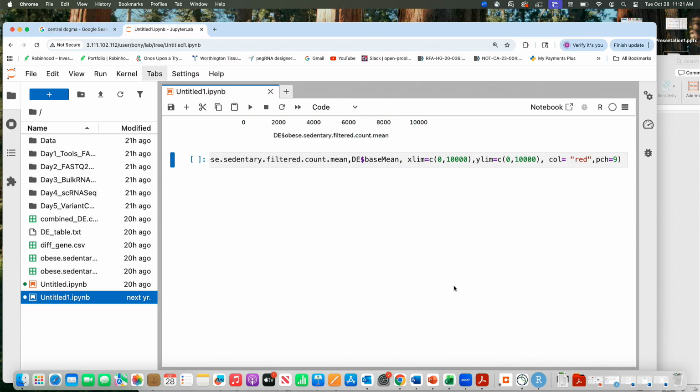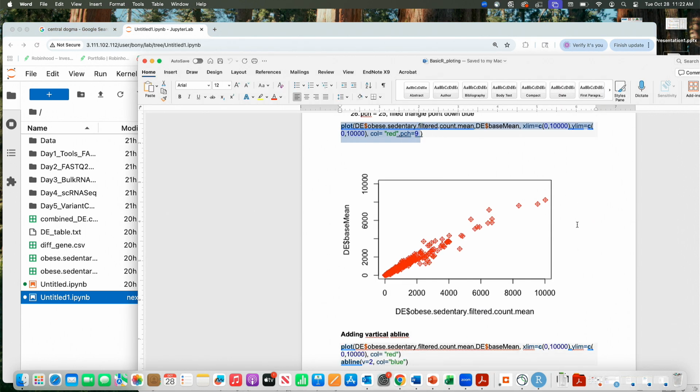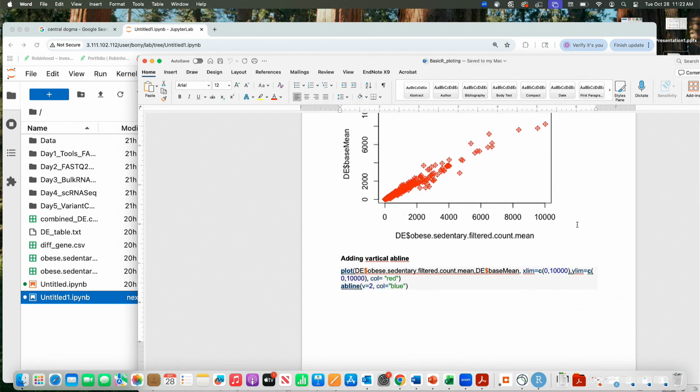The numbers are given, and if you run them, now my graph looks like a diamond plus there. So you can change this to any shape. Would you like to try a couple of shapes? Okay, great job. So I have done that.